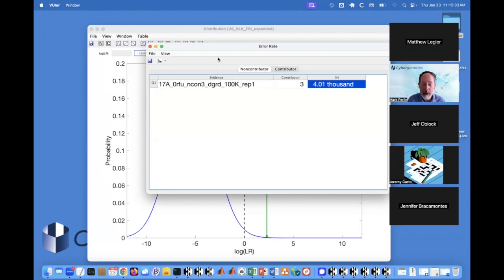So you can do it either way, Matt. You can click on a button and be obscure if you'd like, but most juries or judges wouldn't know what you meant by 2.49 times 10 to the -4th. So, okay. So this is the ability to report error rates.